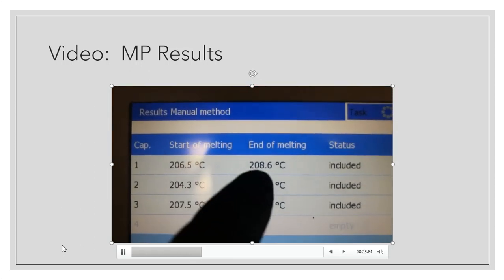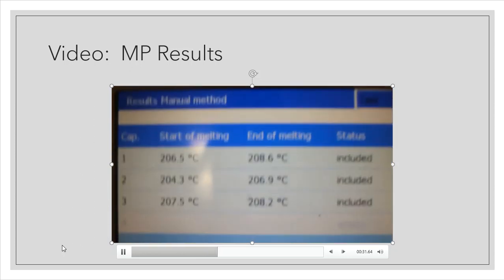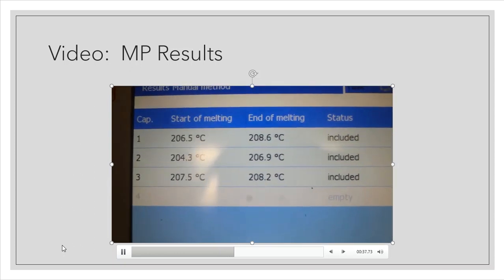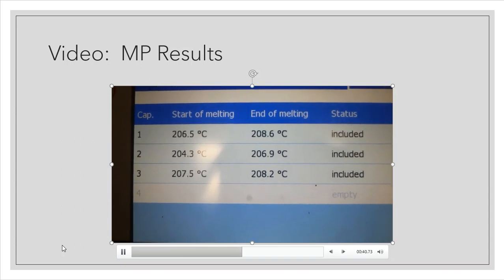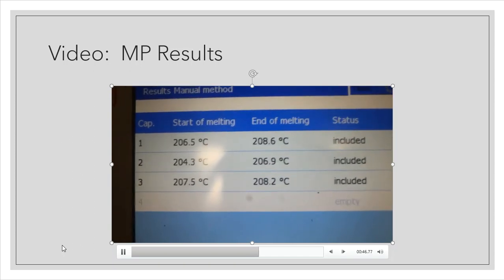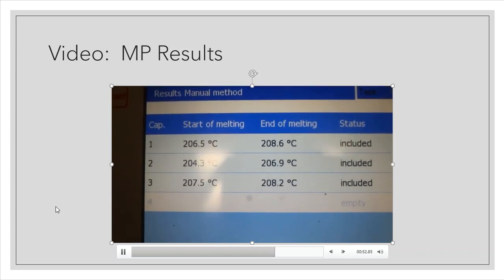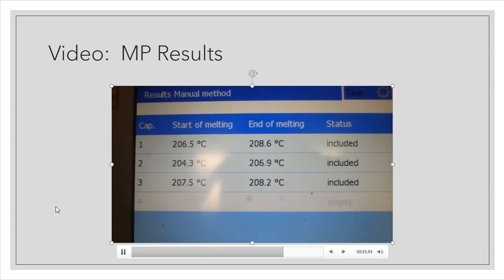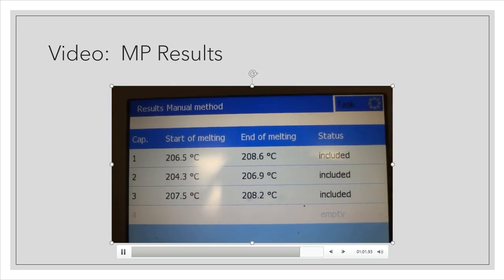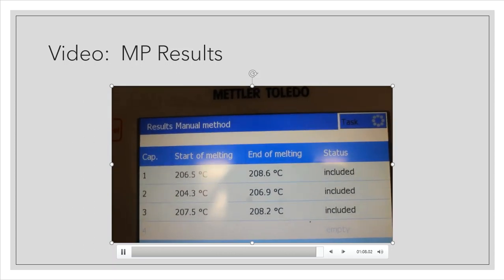Folks, whenever I see 206, 208 that close, 204, 206, 207, 208, whenever that range is a very close range, that means that this is a very pure product. So I feel very good about this melting point data that's coming my way. And I can make a note of that maybe in the laboratory notebook, that these were really tight, close ranges. And that's a very good sign that the product purity is very, very good. All right, so there's the data from all three samples, and you can use that melting point to determine if those bromines have added on to the same side or have added on to the different side of the molecule.